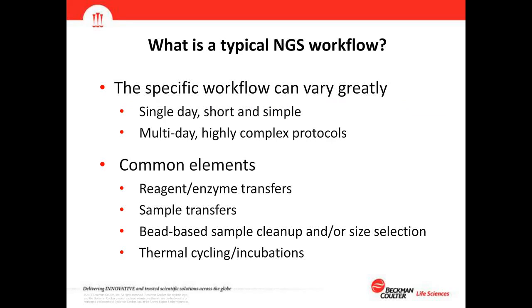The thing about NGS sample preparation or NGS library construction is that the specific workflow, depending on the kit you are using, the sample material and your sequencing interest, can vary greatly. It can be a single day, short and simple, but it can also be multi-day, highly complex protocols. Common elements of such a workflow are reagent and enzyme transfers, sample transfers, bead-based sample cleanup and/or size selection, and thermal cycling and incubations.